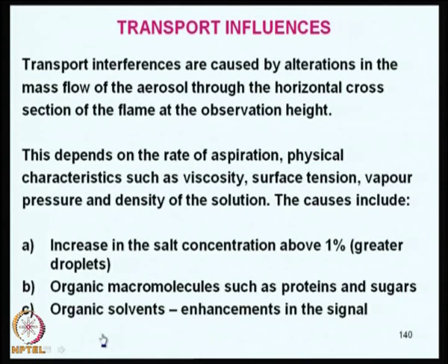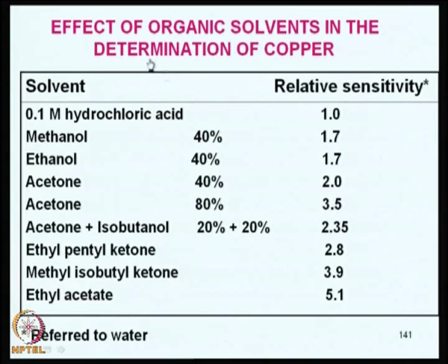So, the interference can be used for constructive as well as non-constructive purposes. If the matrix is fixed, then the interference is deleterious. If the matrix is not fixed and you want to develop a method, then you may like to deliberately add it and get a higher absorbance for the same solution, that means improve the sensitivity. You can take a look at this table.